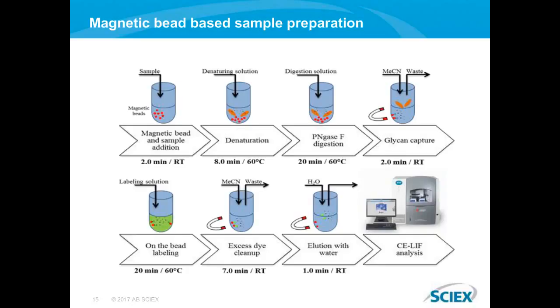And it's even better for us, because if we are doing this labeling reaction at 60 degrees during 20 minutes, there is a significant loss of fluid, which means it's a natural concentration of the labeling reagents during the labeling reaction, which even helps us to speed up the labeling. So that's the reason why we can get it done in 20 minutes, which is much faster than the usually used overnight labeling methodologies.